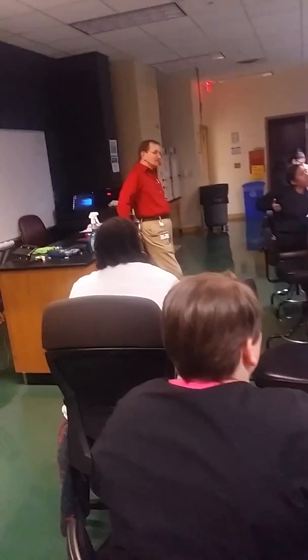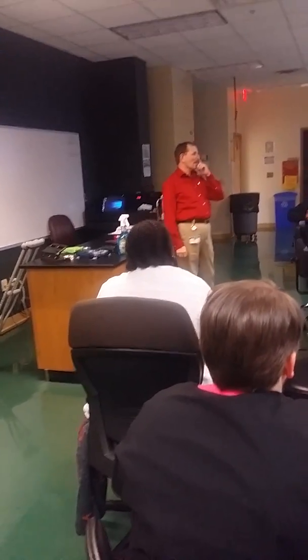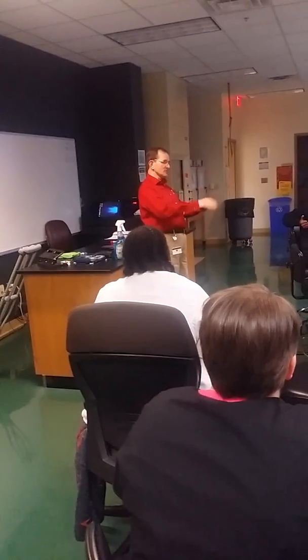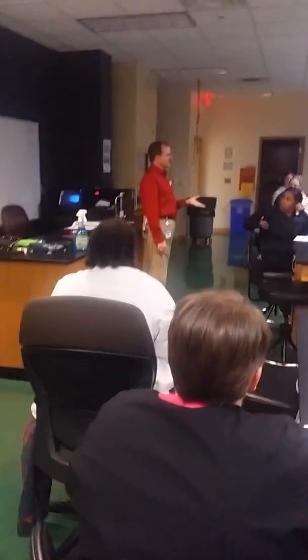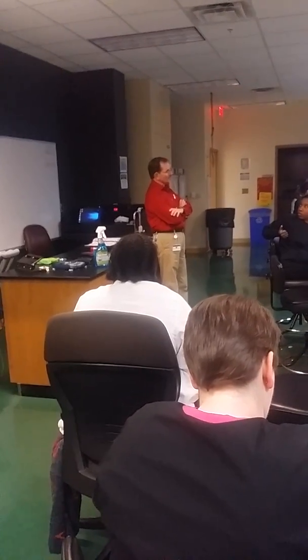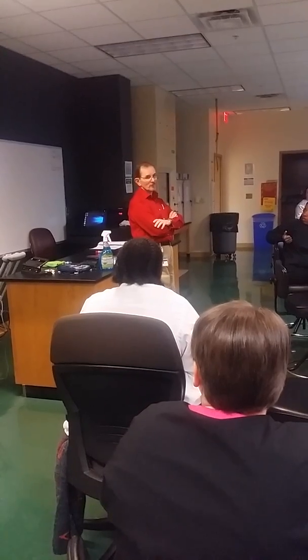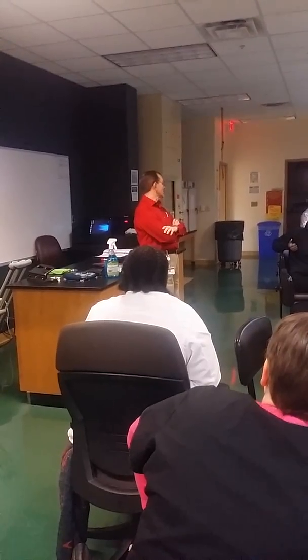Yes, ma'am. Are we gonna get our own supplies? Like, are we gonna be sharing microscopes? I'm just thinking, how do we ask if we can use a microscope? Well, you can get the microscopes, and usually we just set them up over on the far counters because there's usually a lot of stuff going on the lab tables. And as far as supplies, Miss Mocker has it in there, if you mess up your Enterotube, which costs $25 each, then she requires me to take a point or 5 points off your lab report grade.